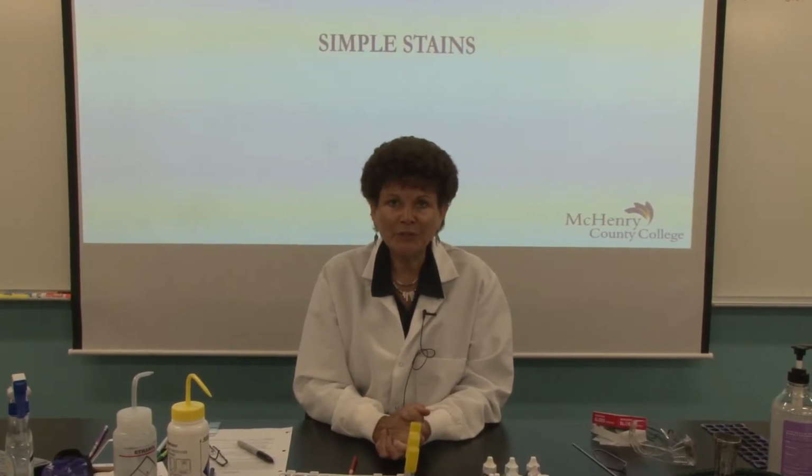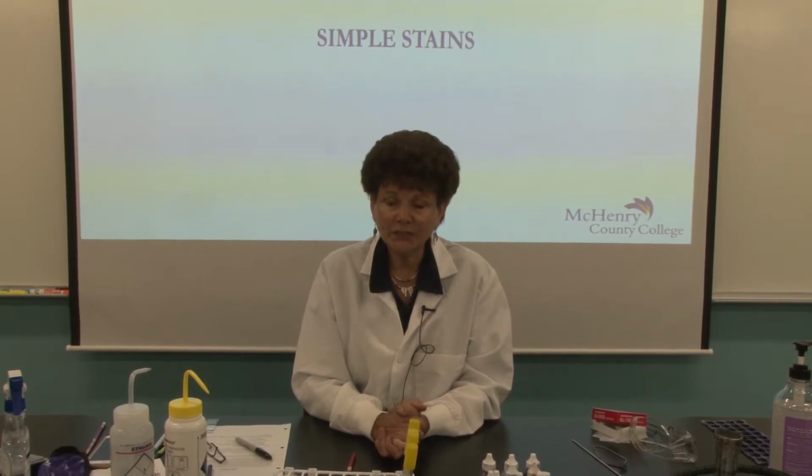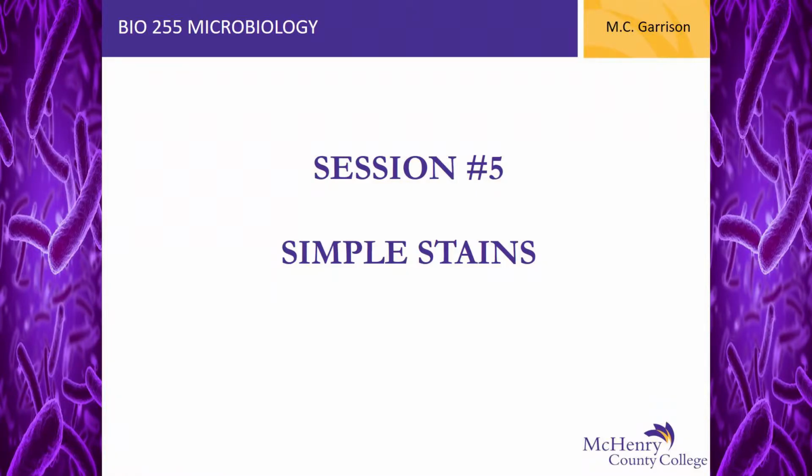Welcome back to Bio 255 Microbiology Lab Session 5. Please turn to Session 5, page 1 in your lab manual. Today we are going to perform simple stains.